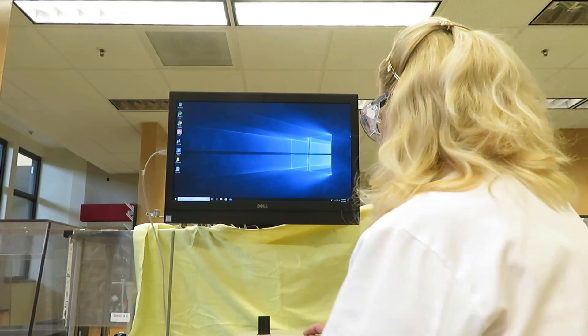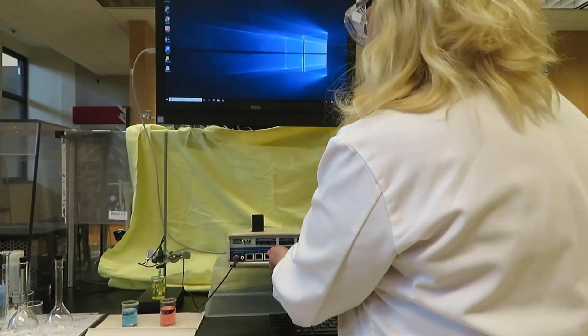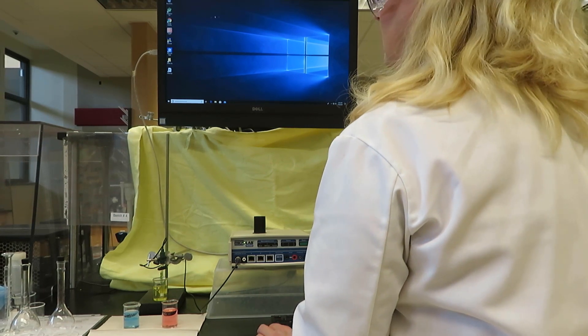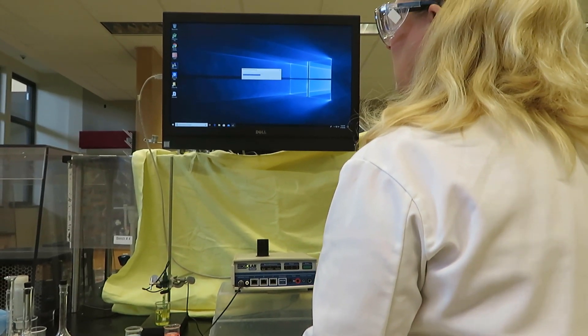We'll start by turning the Microlab unit on. The green button is shown, and now we can double-click on the Microlab app.